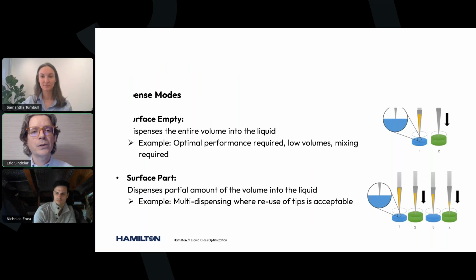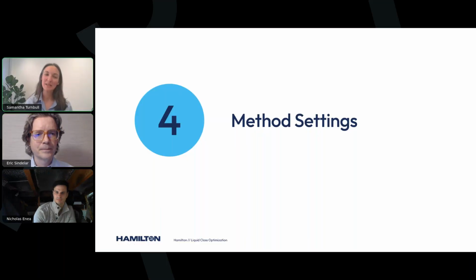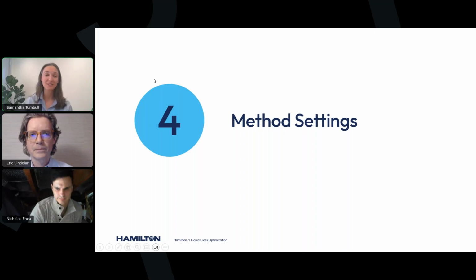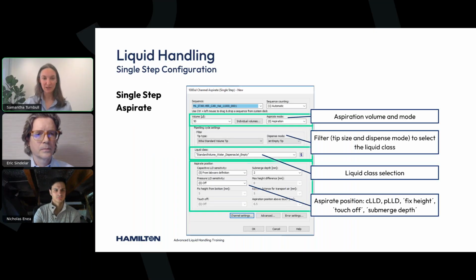Well, now I'll hand it over to my colleague, Samantha Turnbull, to give more insight on method settings and Labware settings. Thank you, Eric. In addition to all of the properties and parameters that Eric just mentioned, there are a number of settings within the aspirate and dispense commands themselves that will influence your pipetting behaviors. So let's start with the aspirate step.